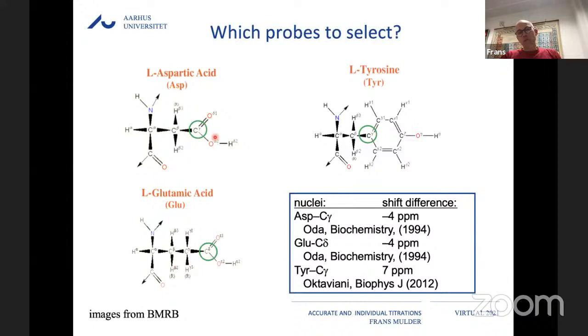The other thing is size. And there, I don't know what the limit would be nowadays for the size of a system, because the experiments that we did relied on protonated, meaning hydrogenated proteins, not deuterated. And in that sense, relaxation of these carbon coherences is generally quite bad.